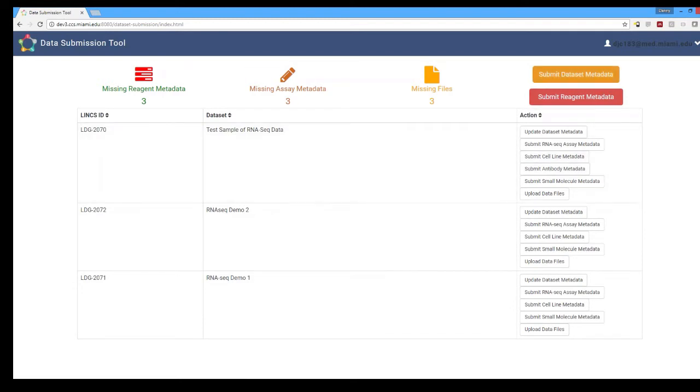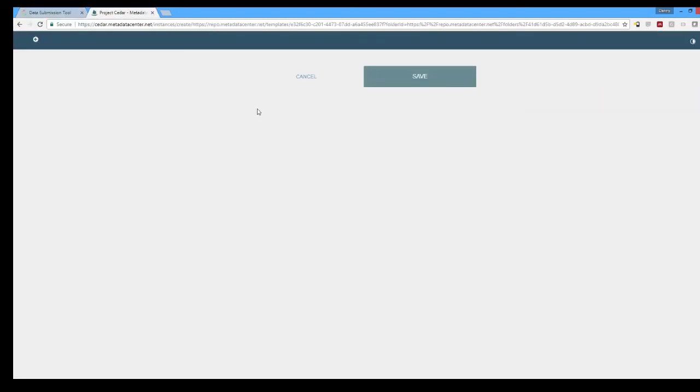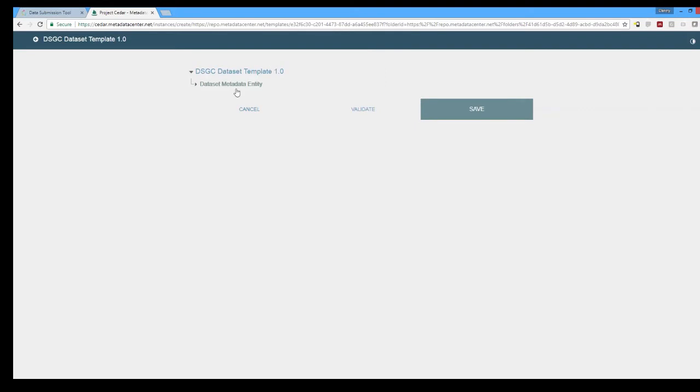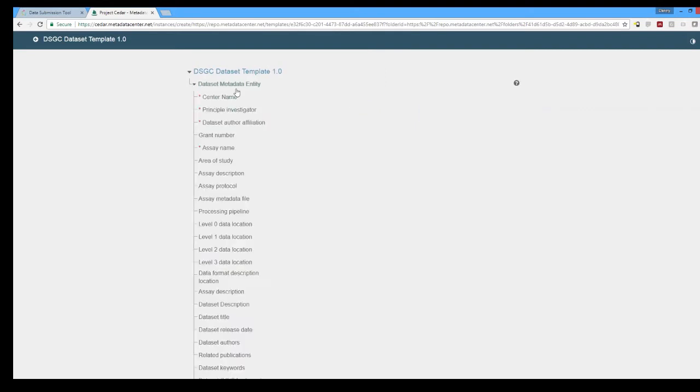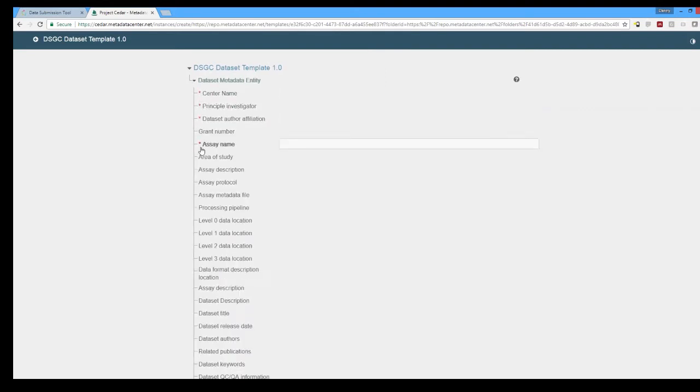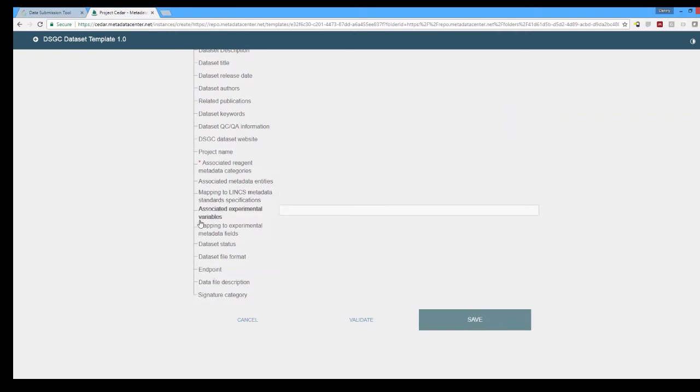Let's go ahead and start a new dataset though. In this dataset we'll be taken to Cedar through the single sign-on and you can see the red asterisked individual fields are the ones that are required by the Cedar template itself.